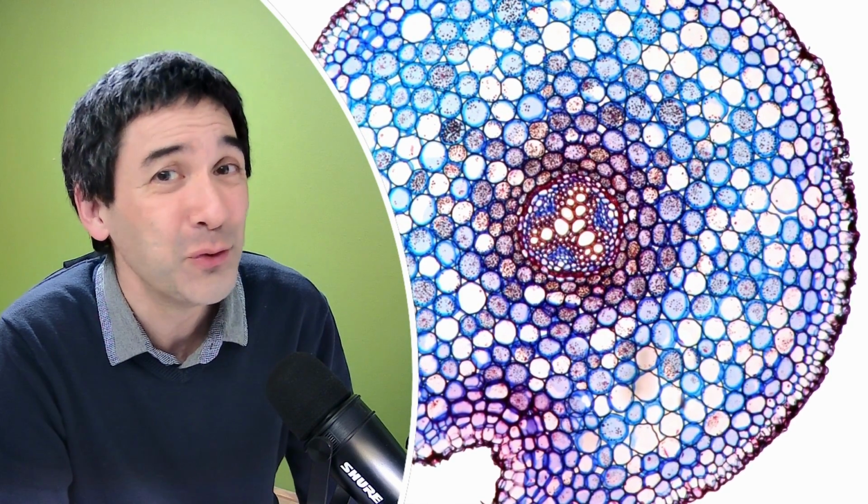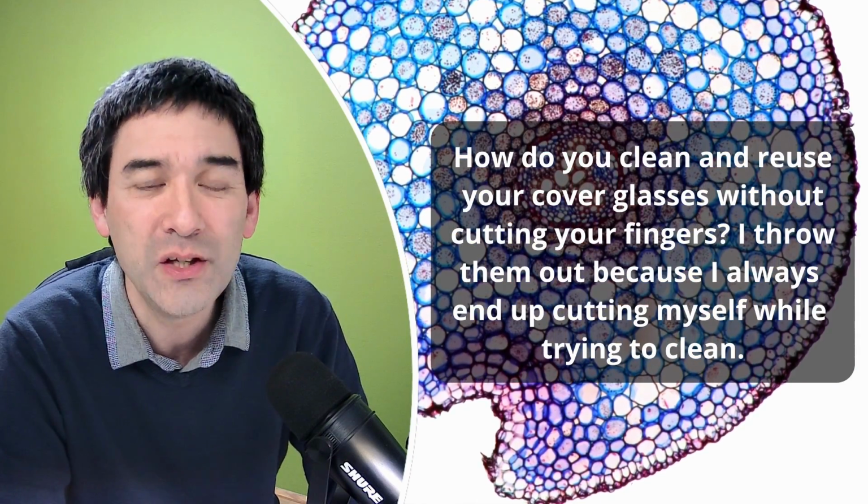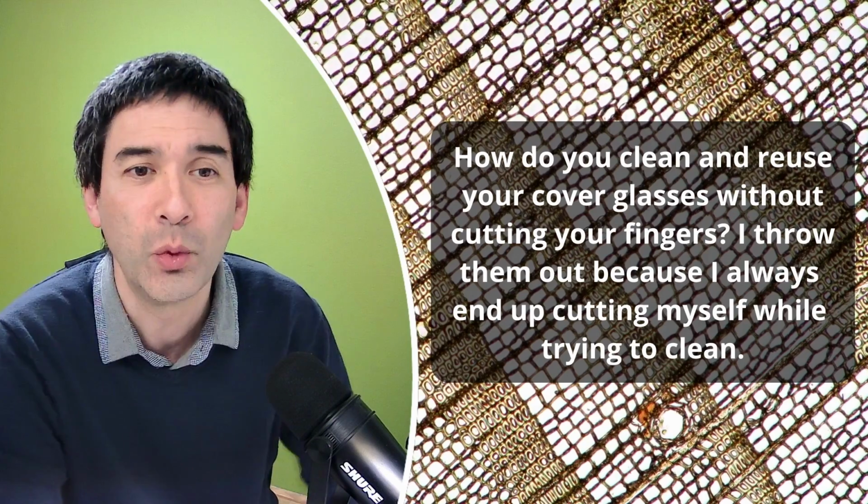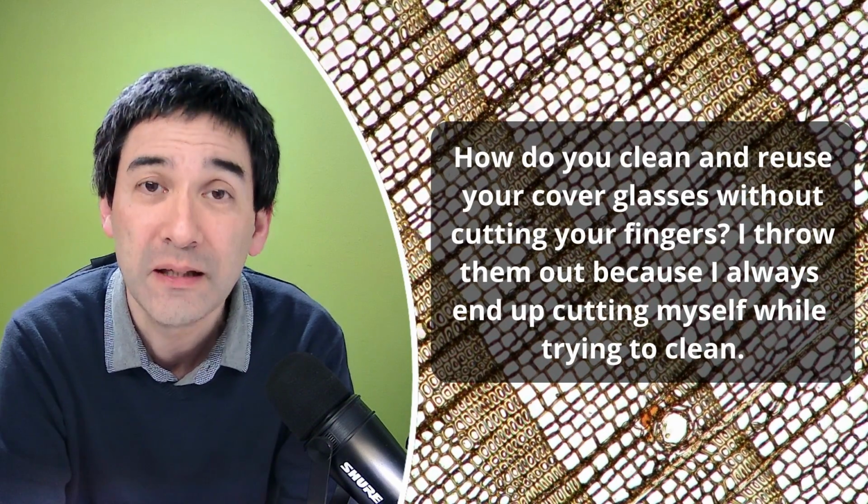So we move on to the next question here, and the next question has to do a little bit with practical microscopy: how do you clean and reuse your cover glasses without cutting your fingers? I throw them out because I always end up cutting myself while trying to clean them.